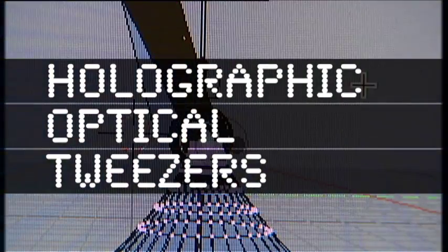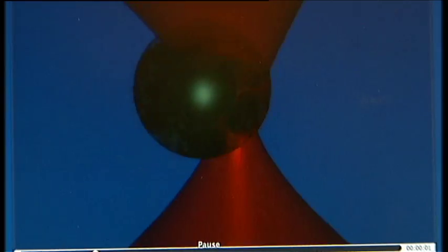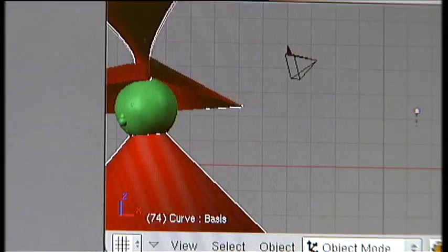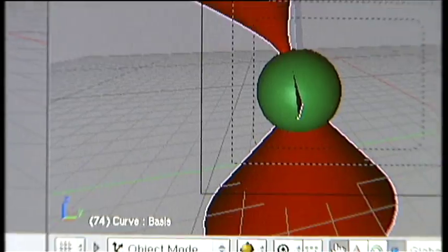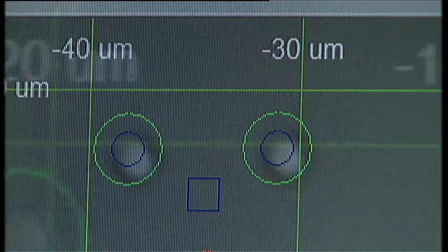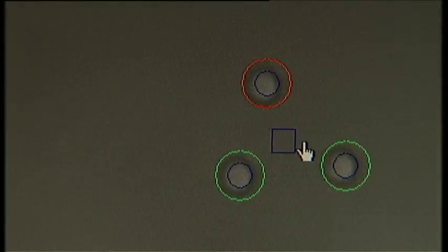Optical tweezers use tightly focused beams of laser light to trap and move microscopic objects like bacteria and cells. At this high magnification, the whole screen is only about a tenth of a millimetre across and each of the objects you see are a thousandth of a millimetre in diameter.